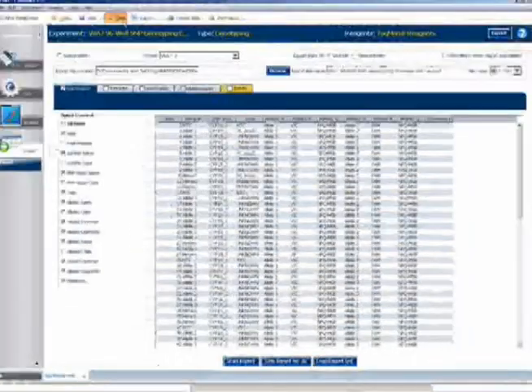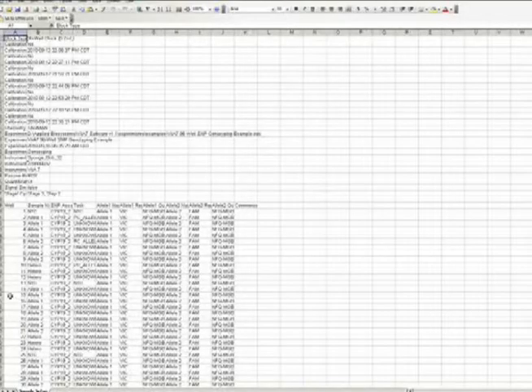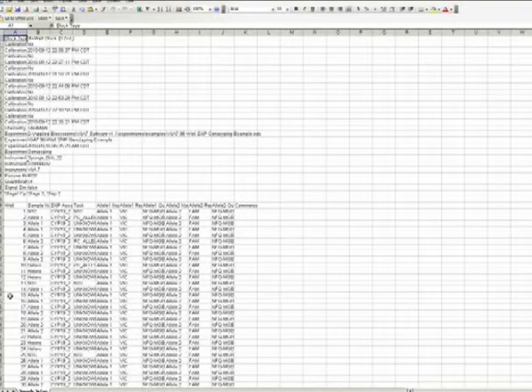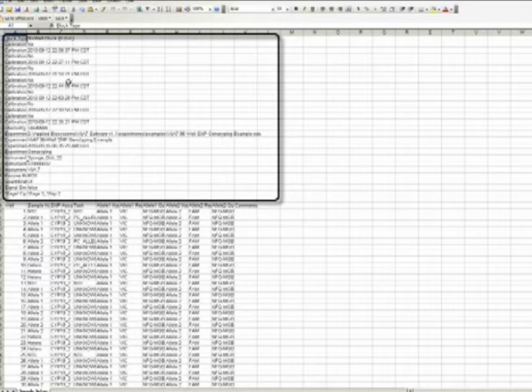Okay, I'll close this file and minimize the VS7 window for just a moment. Here's my exported Excel file on the desktop. I'll open it. First job, I need to make a change to the format. You see all this information at the top?